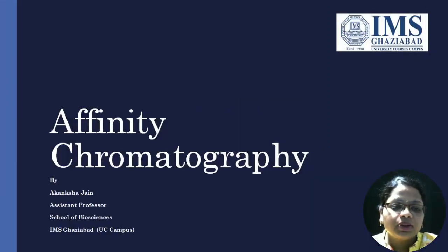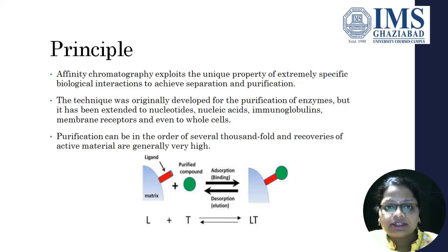Hello everyone. Today we are going to discuss affinity chromatography. Affinity chromatography is a very important technique in analytical chemistry which exploits the unique property of extremely specific biological interactions to achieve separation and purification.